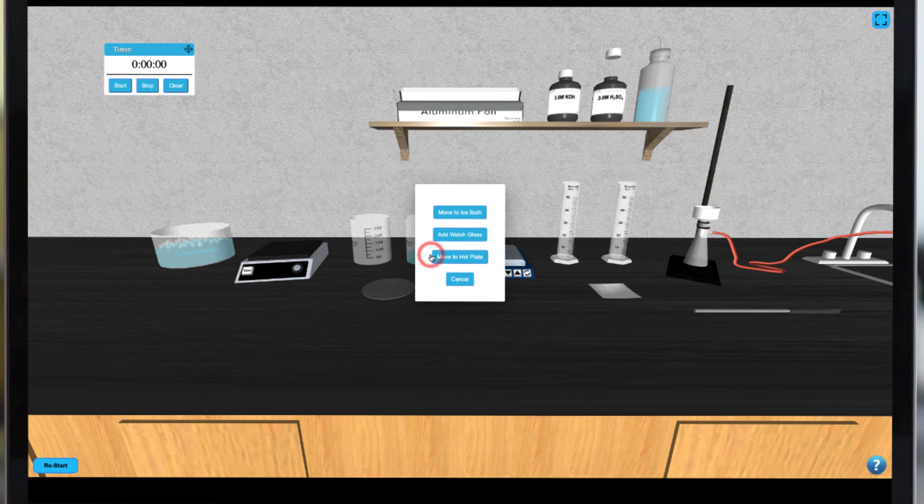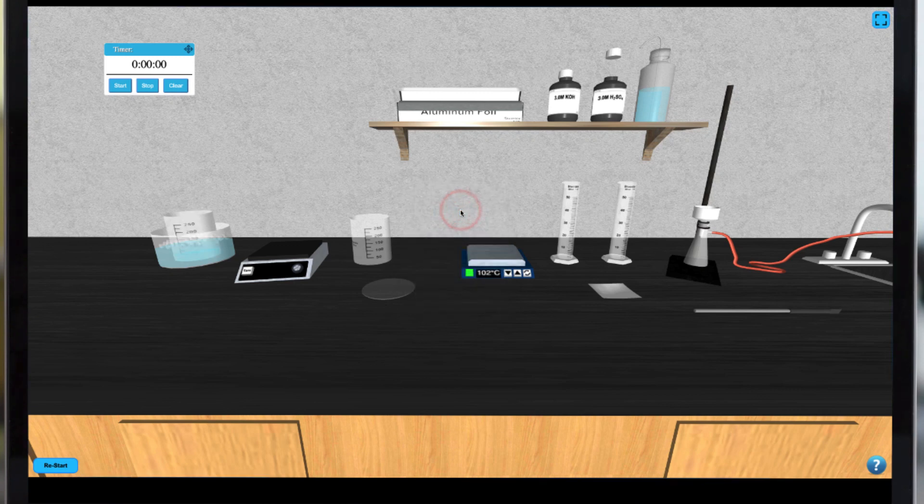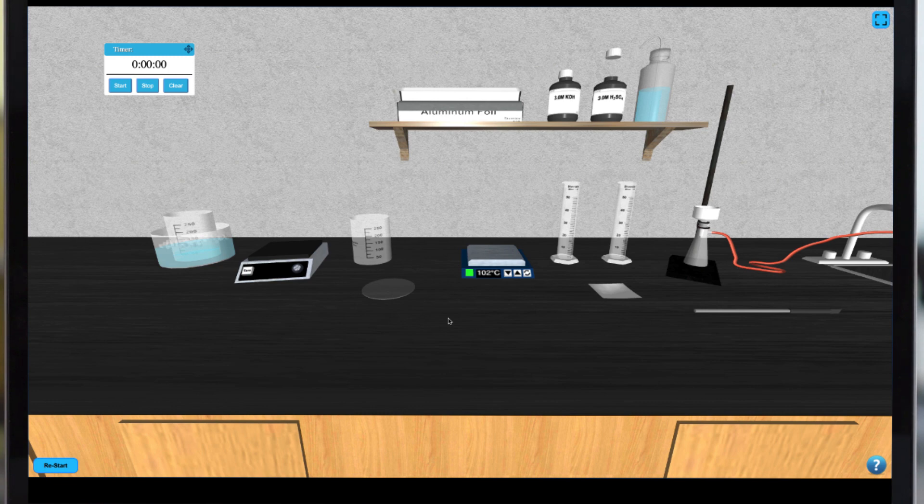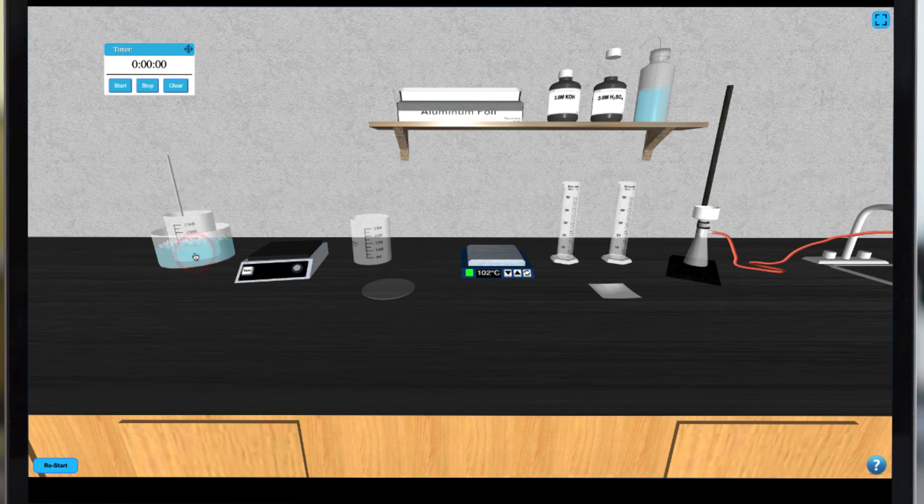While your sample is cooling in the ice bath you can initiate the crystallization process by scratching on the beaker with the glass stirring rod. This can be done either by clicking the appropriate place on the beaker or by clicking the glass stirring rod directly.